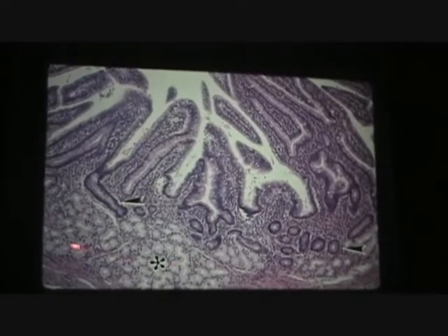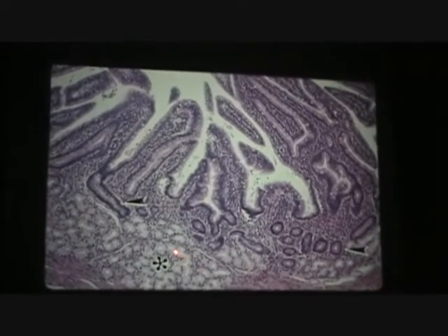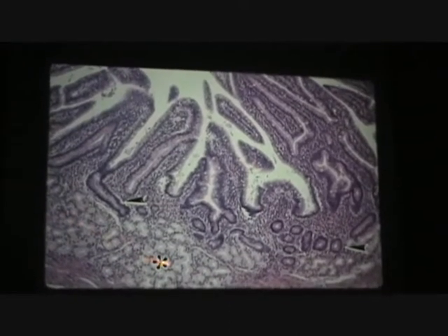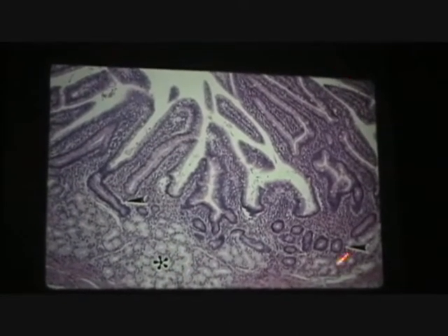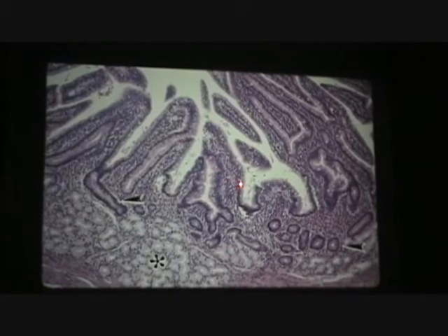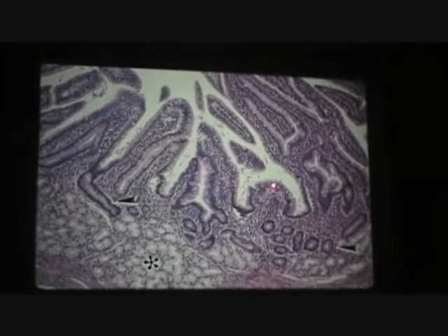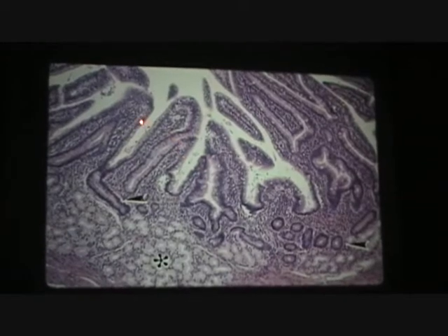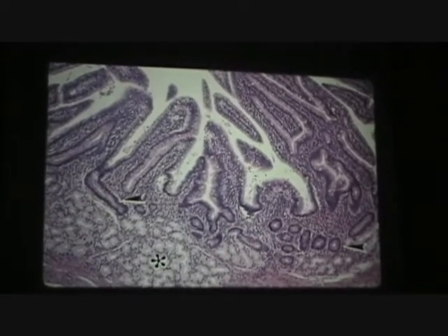And then underneath, mucus cells, Brunner's glands, once again. Another section of duodenum. A little harder to see those little holes, the bubbles, but still goblet cells. You see them much, much better as you go farther down in the intestines.